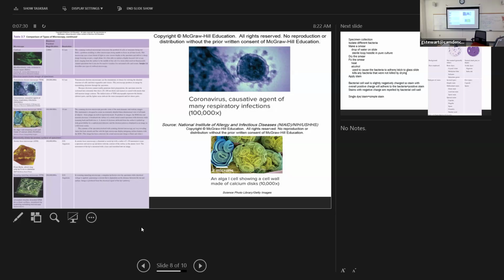That's a picture of a coronavirus, and you can see it's been sliced, so you can look inside of it. You can see the spike proteins on the outside and the nuclear material on the inside. It looks like it's attaching to a eukaryotic cell there. And it might have been photographed because someone was trying to study how the virus attaches and which receptors the virus attaches to on eukaryotic cells.